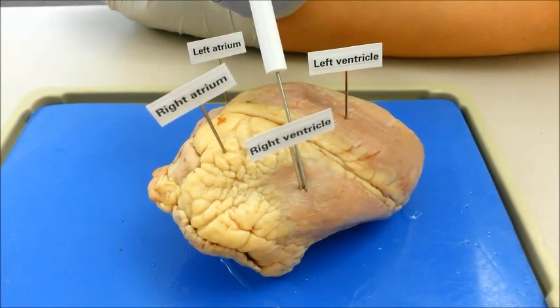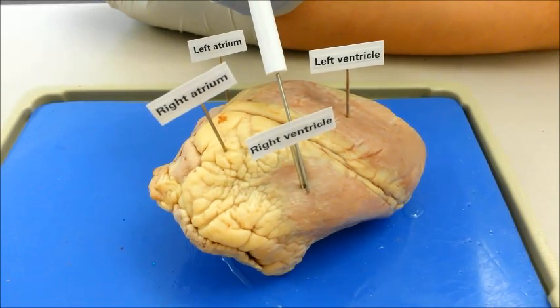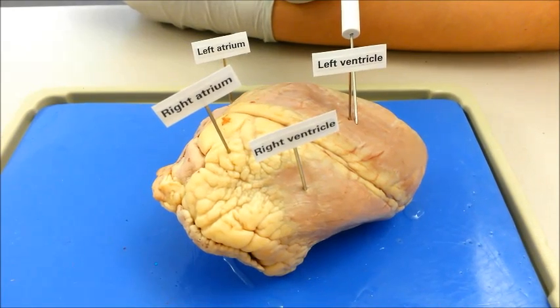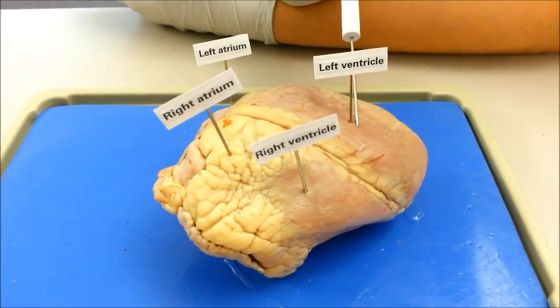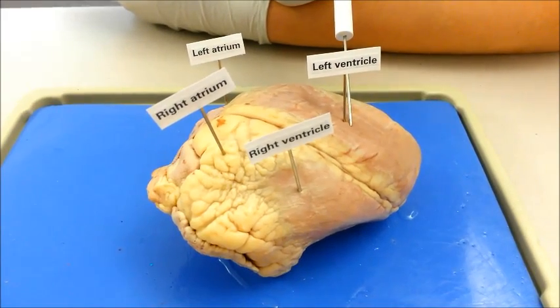The right ventricle receives blood from the right atrium and pumps it into the main pulmonary artery. The left ventricle receives blood from the left atrium and pumps it into the aorta. Then the aorta carries and distributes the oxygen-rich blood to the rest of the body.